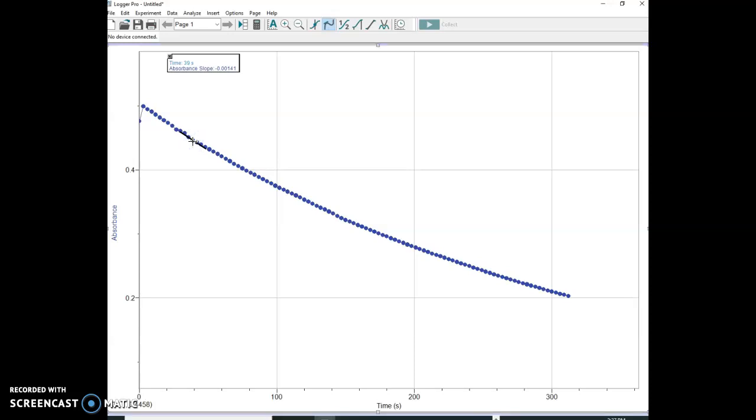Now you're going to change that to a positive number, and you are going to say 1.41 times 10 to the negative 3. Right. You're going to do this for each one of them at the same elapsed time from mixing, and each one of those is going to create a slope. You're going to put that in your lab notebook, indicate what the elapsed time was when you did that, and you're going to have 4 different slopes, positive numbers.